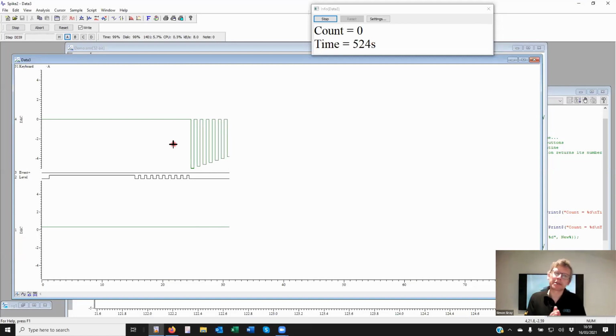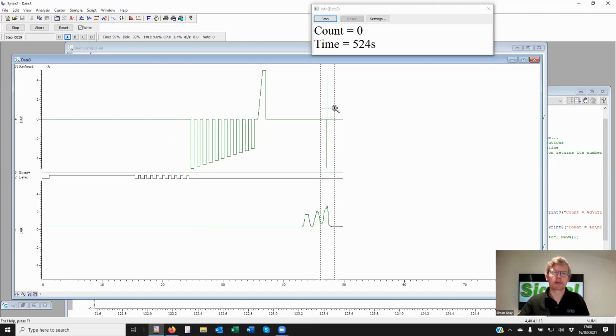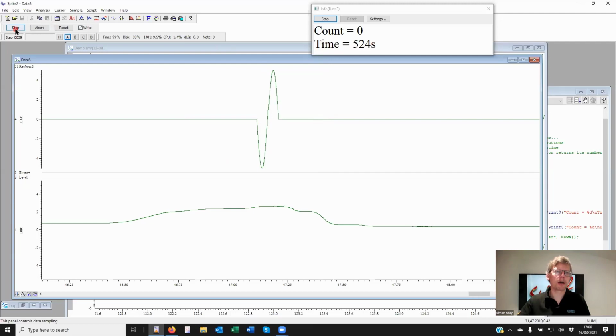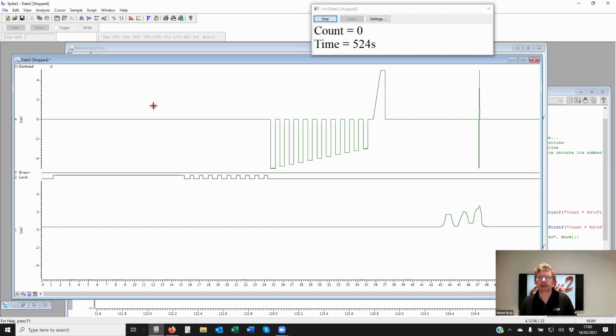We didn't put any markers in to identify that the section changes, but I hope you can see the different waveforms and signs playing out. There's the ramp. Now we're in C, which means if I change my waveform output, they're not quite achieving 2.5 volts. There we go. There's my sinusoid. Okay, so hopefully that shows you how the sections come together, how they can be linked together, some of the variable arithmetic markers and the palette items for all of those waveforms and digital outputs as well.